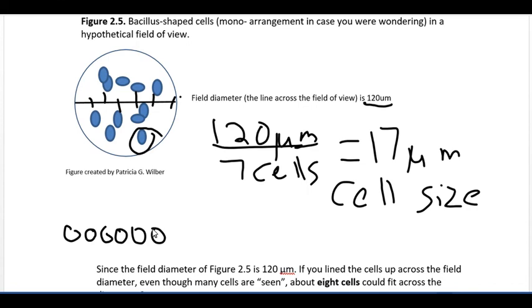Sometimes you don't have that opportunity. You just have a single cell, and you really just have to eyeball it and say this is how many would fit across. Some microscopes have a pointer, and that also goes about halfway across the microscope. And so you can say, okay, how many would fit along this pointer if I were to estimate, and then just double that since that's only halfway across. So little kind of tricks there.